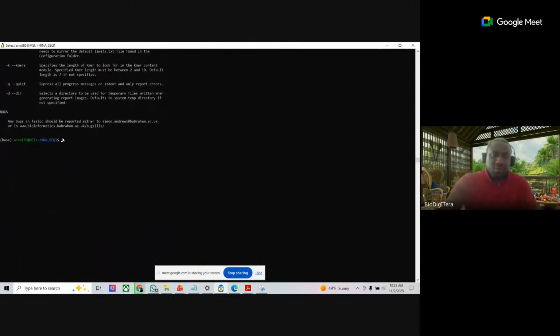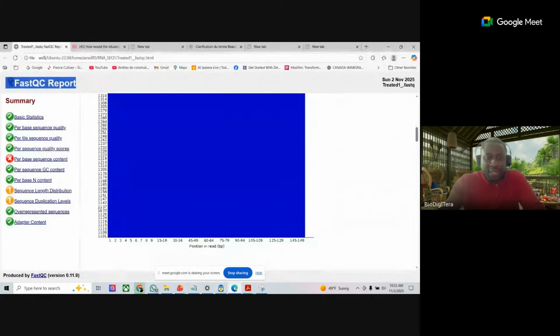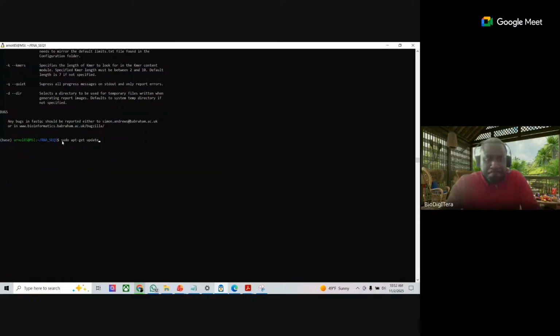See on my screen. Let me copy the same command. I just paste, but it will not change anything because I already have it installed. I don't think it is good for me to run the same command 2 times. Let me copy and paste. Here, this is the command that I am waiting for you to copy and paste, and then you press enter, it depends.